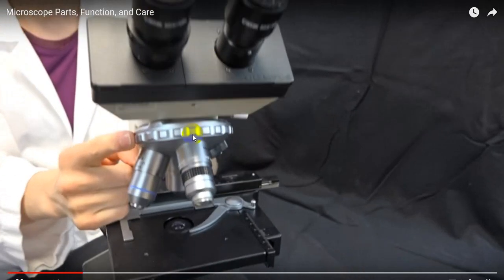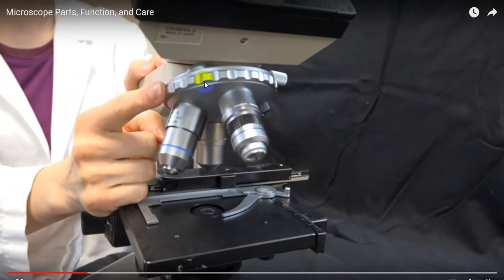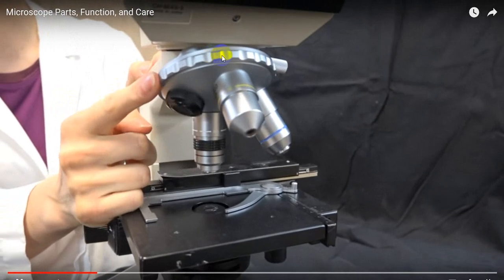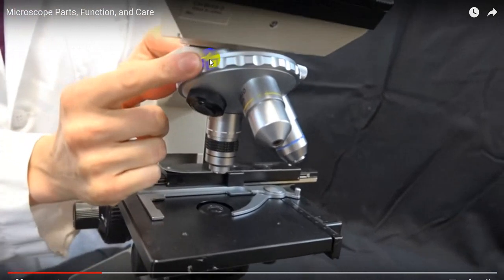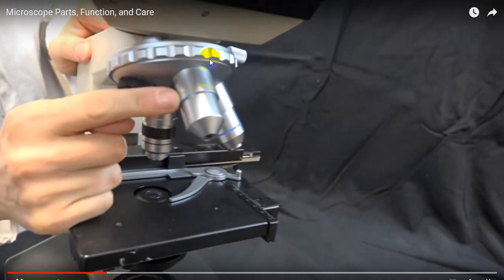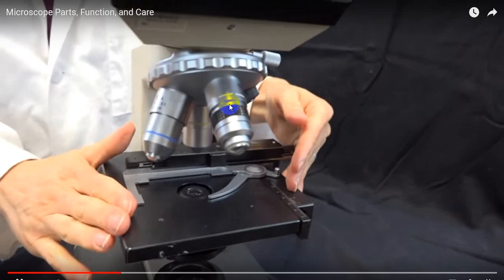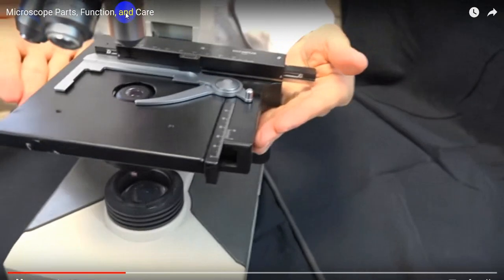The revolving nose piece is this one. Each of the lenses you see, that's the revolving nose piece. That's where the arrow is. This microscope came with 3 objective lenses, a 10x, a 40x, and a 100x. Below the nose piece, these are the objective lenses.